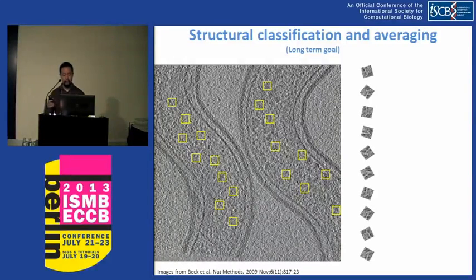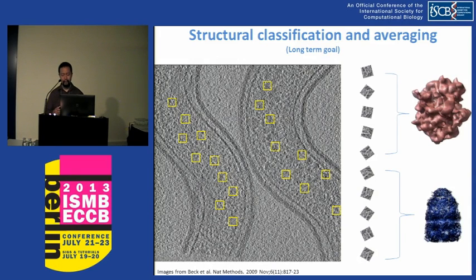And then these subtomograms are aligned so that the instances with the same underlying structure will align in the same orientation.